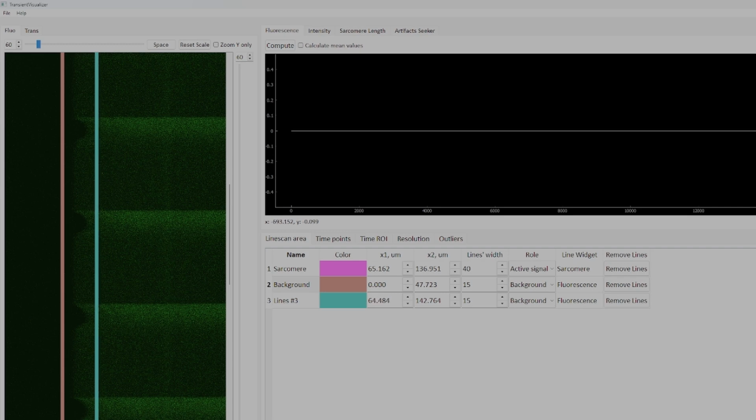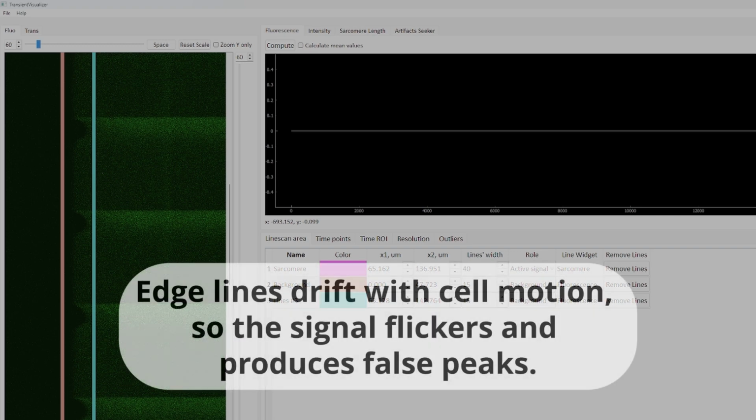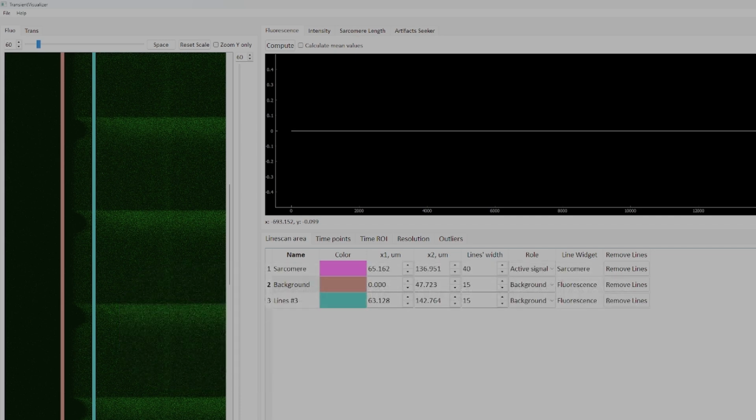Maybe I will do it like that. Here we see some things. In this case, we don't need to use the edges. These are the edges of the cell, because you will just have bad curves. Yeah.